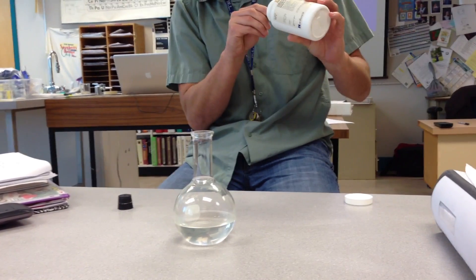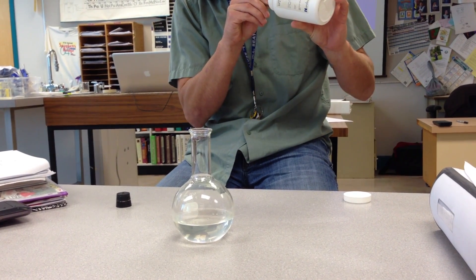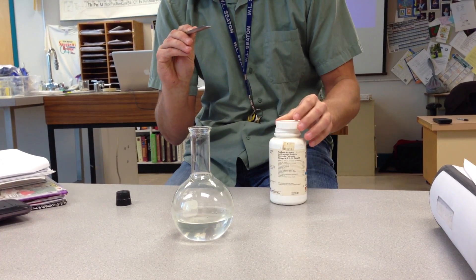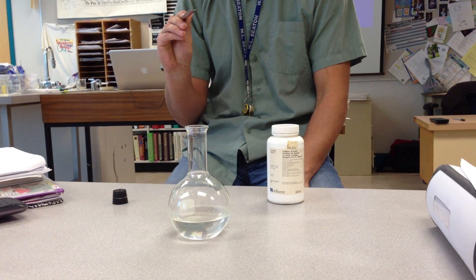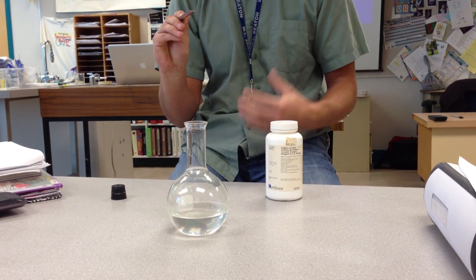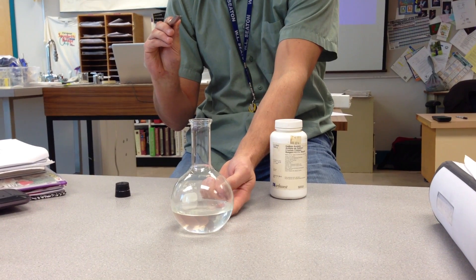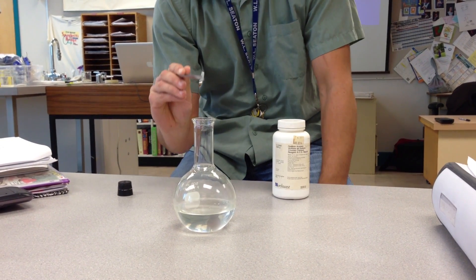We're going to take a single crystal of sodium acetate to act as a seed. Once this crystal is in there, the sodium acetate ions have something to grow onto and we're going to get back to the stable condition. By the way, this is at room temperature — if you were to touch it, it would be around 20 degrees.